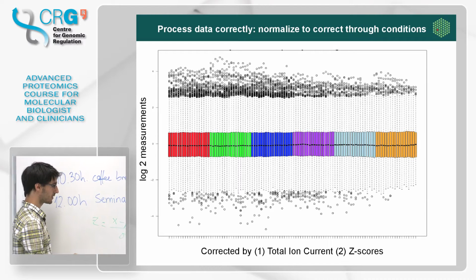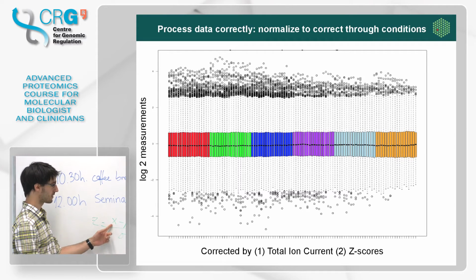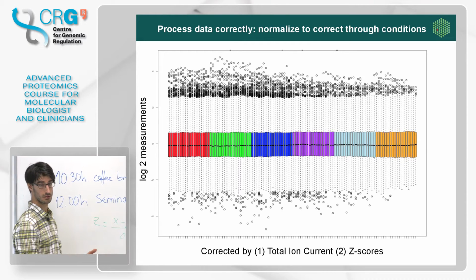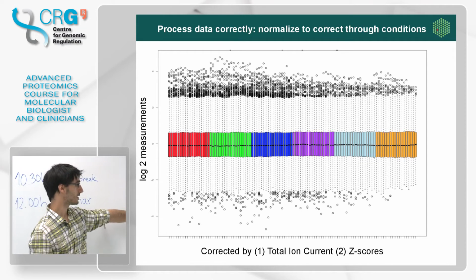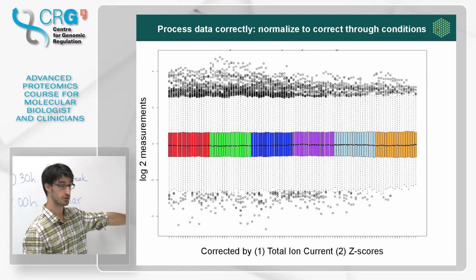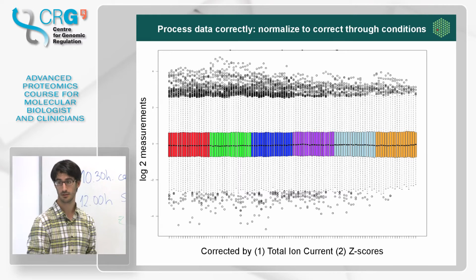What you're doing is basically trying to see how many standard deviations each one of your data points is over the mean. Now all of these data points are going to have the same mean, centered around 0, and they are also going to be comparable because they will have the same standard deviation, 1.